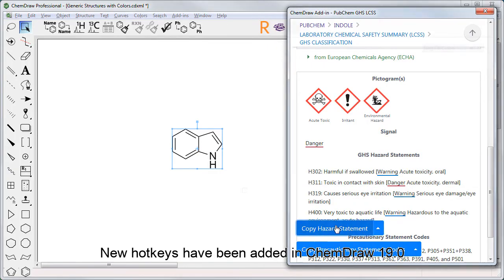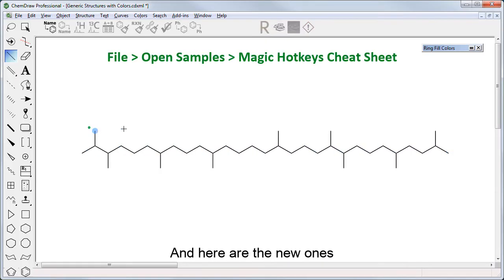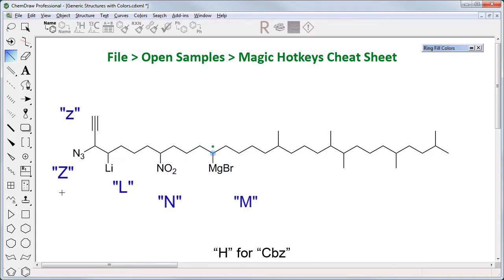New hotkeys have been added in ChemDraw 19, you can follow the path above to find the new cheat sheet, and here are the new ones. So we have capital Z for azide, capital L for lithium, capital N for nitro, capital M for MgBr, capital H for Cbz, Y for Boc, capital Q for Fmoc, and capital O for COOH.